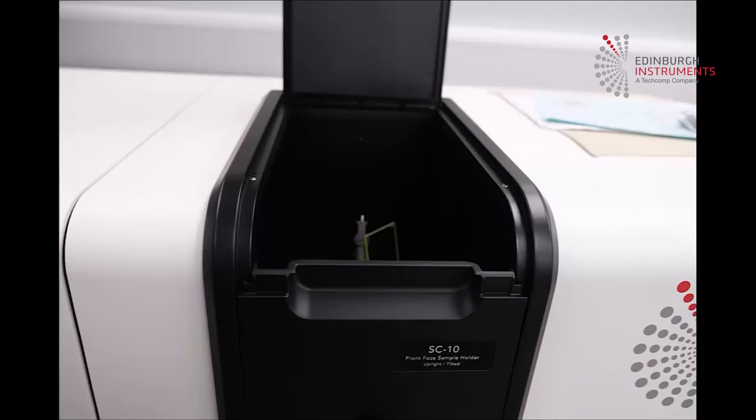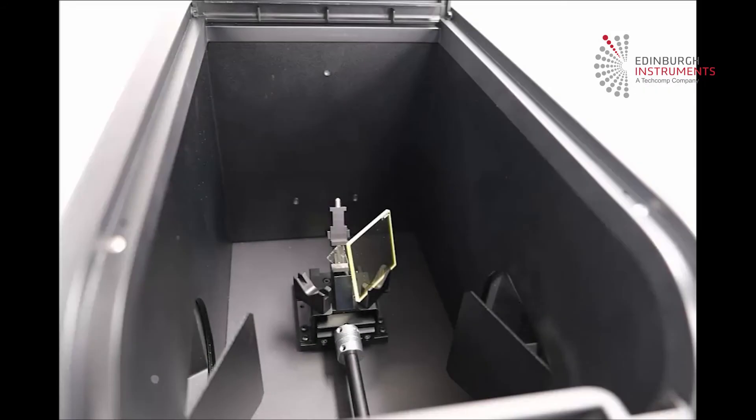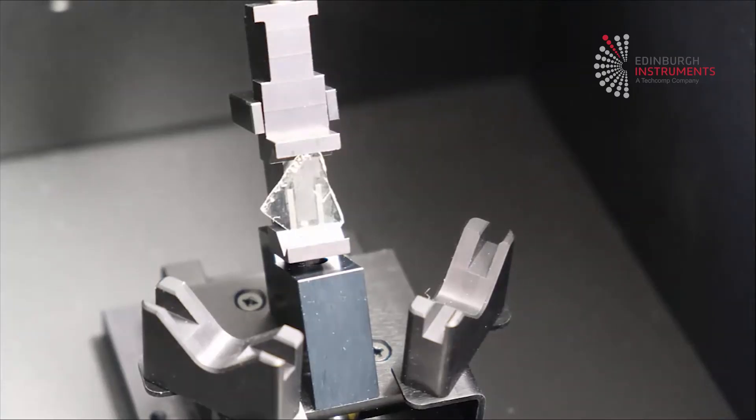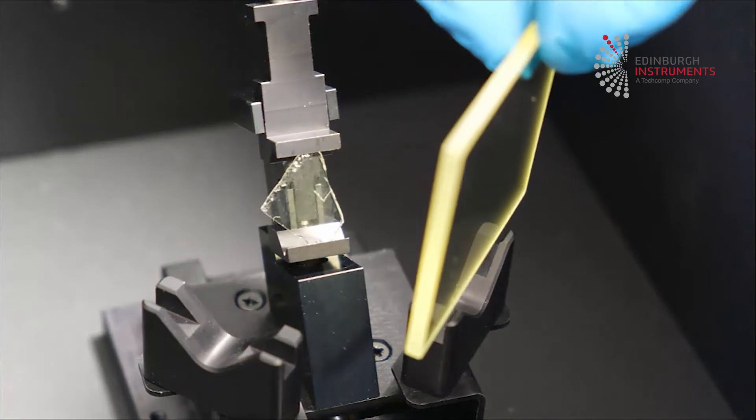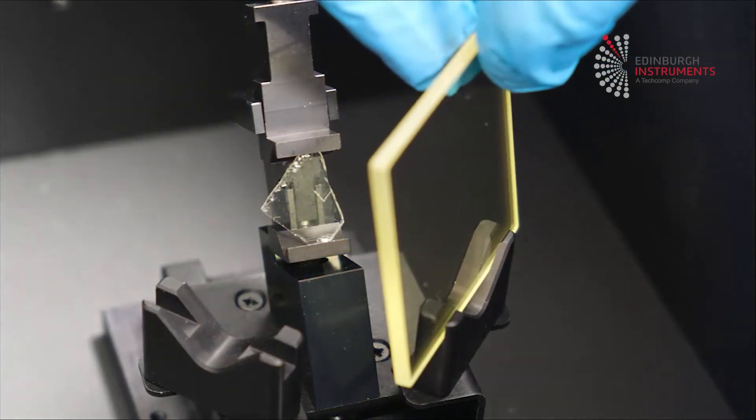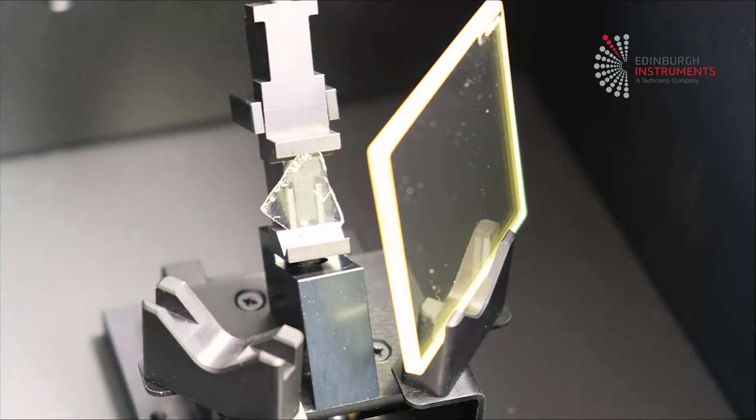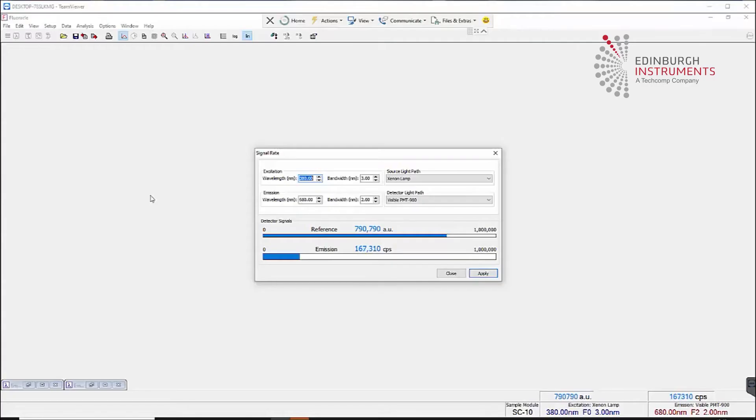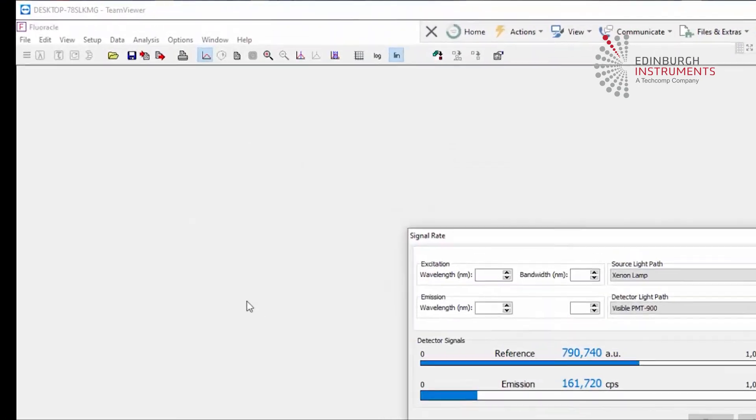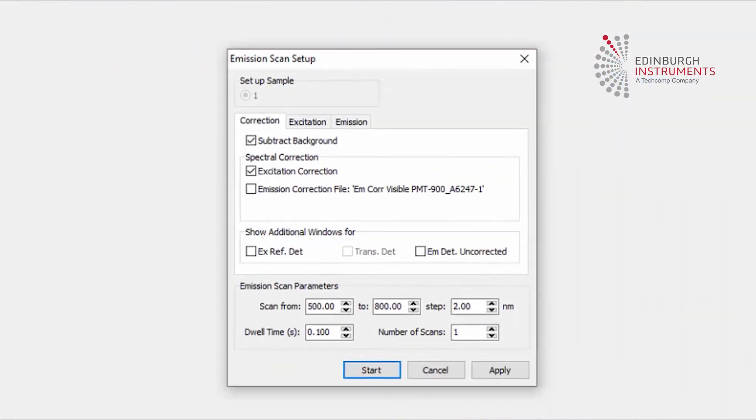Now let's consider stray light. Single monochromator systems do not suppress as much light as double monochromators. With highly scattering or reflective samples, especially those excited with UV light, long wavelength pass filters should be placed between the sample and the emission monochromator to help the emission monochromator filter the excitation beam. This filter is used to block the excitation beam, and the choice of the filter depends on whether an excitation or an emission scan is being measured.